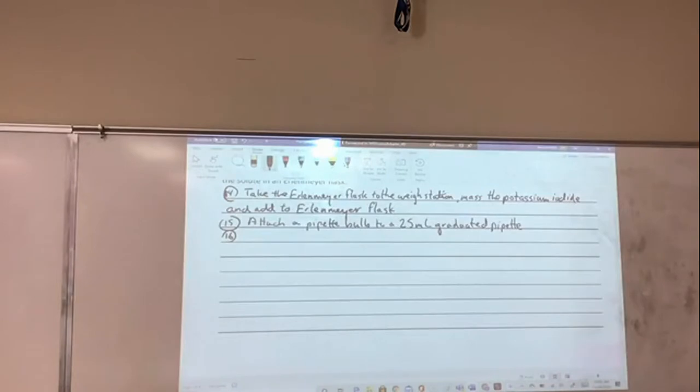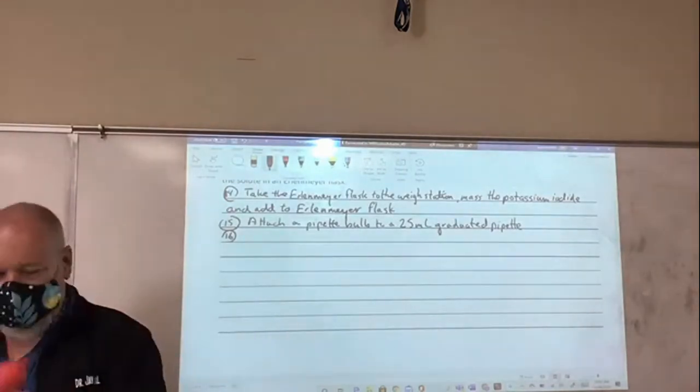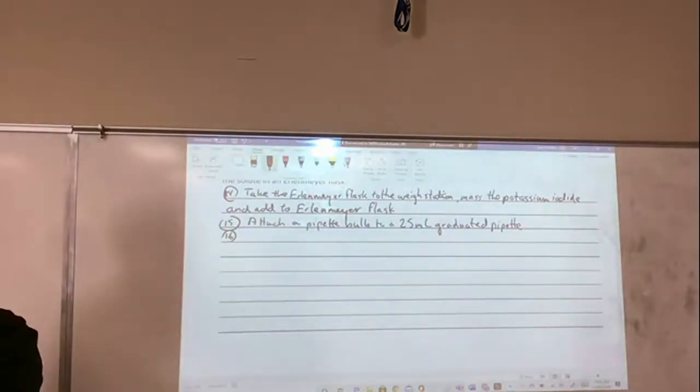Okay, so the S button here. So the next thing that we need to do is we need to get the air out of here, right? So that we can create the suction in the first place. So we're going to say, I need to do that.